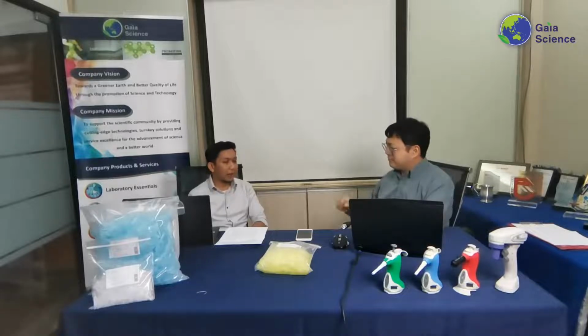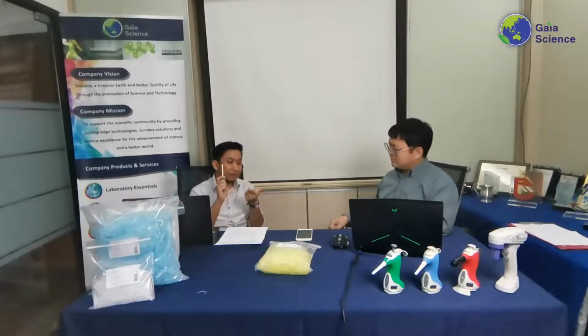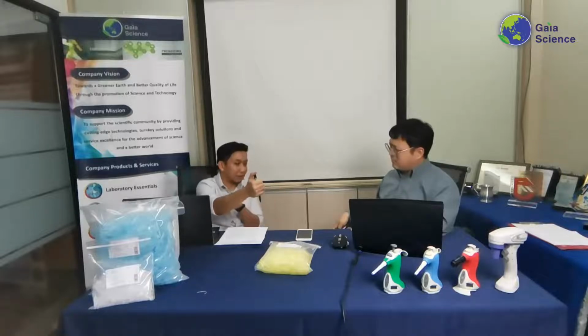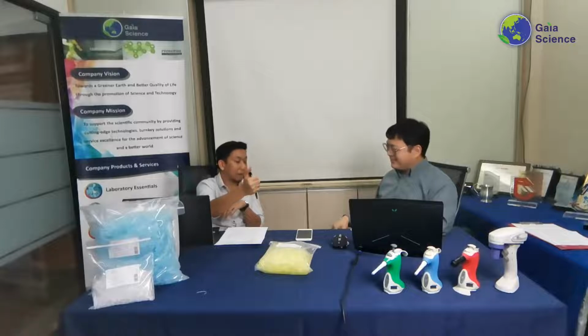Agree. So there are two things. If you are changing to a new brand of pipette tips, there are two things you need to consider. First, as you mentioned, can it fit their pipette, and secondly, can it fit their pipette rack? Because sometimes when you refill a pipette rack and then try to get the pipette tips using a pipette, it's stuck there. Oh yeah, that's correct. This is something that sometimes people might miss out.